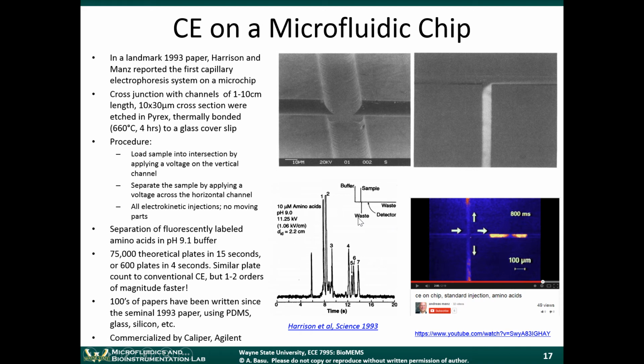In the early to mid 90s, Harrison and Manz reported some capillary electrophoresis systems that were done on a microfluidic chip. This was an important time because this is really the beginning of the microfluidics field, the modern microfluidics field that we think about with microfabrication techniques and microfluidic chips.